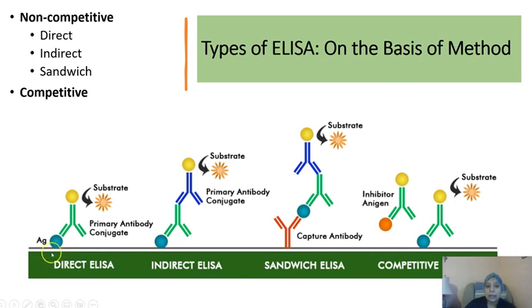In a direct ELISA, we coat our solid phase with our actual samples, our protein extracts that we have. We then bind a primary antibody that is specific to the antigen of interest that is already conjugated to an enzyme that is going to cause the color change. And then there is no other step. We basically just bind the antibody, wash off anything that's not bound, and then add the chromogen to cause the color change with the substrate, and then that color change is what we're utilizing.